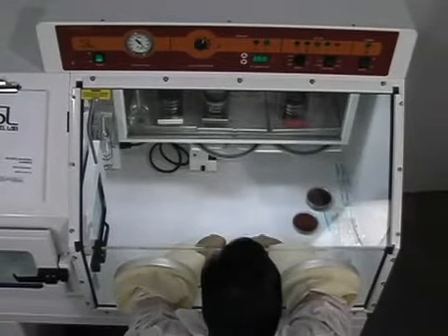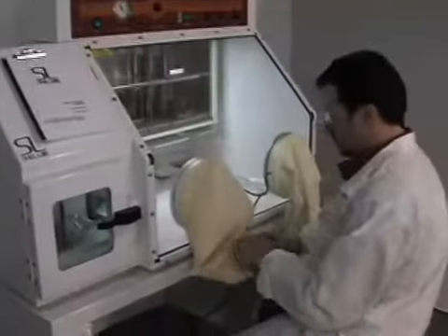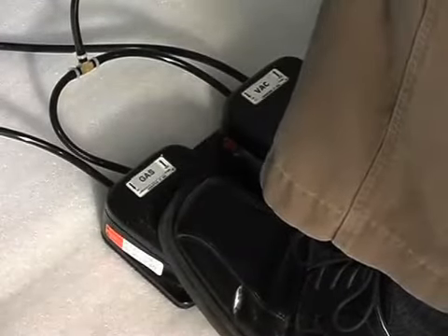The Bactron comes equipped with everything needed to get up and running. Various sizes of additional sleeves and cuffs can be purchased to maintain comfort and hygienic conditions from one user to the next. The sleeve system is controlled via dual foot pedals that operate the internal vacuum.